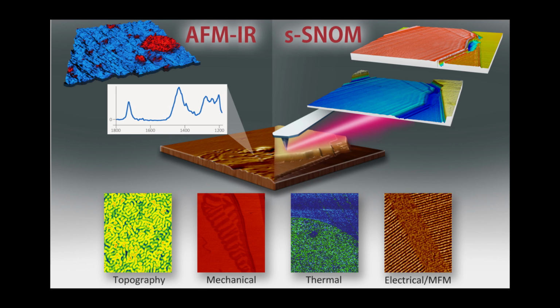Okay, so there's a question about how to prepare polymeric and biologic samples for AFM-IR. So the AFM-IR technique works best on thinner samples. Effectively, using the resonance enhanced technique, we can measure samples if they're on the right substrate down to as thin as 1 nanometer. If they're on arbitrary substrates, 10 or 20 nanometers. So really, the answer in terms of measuring polymer or biological samples is getting a sample which is thin.